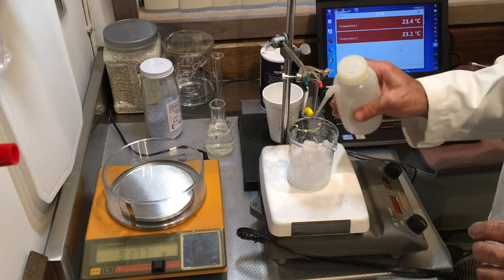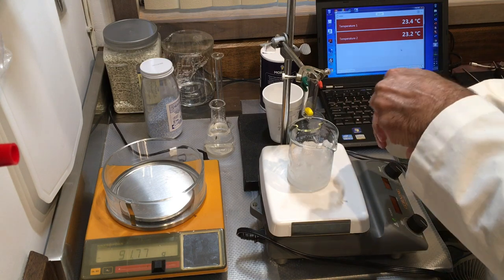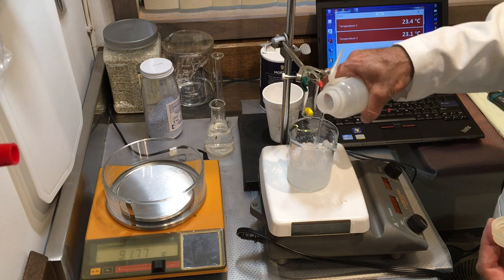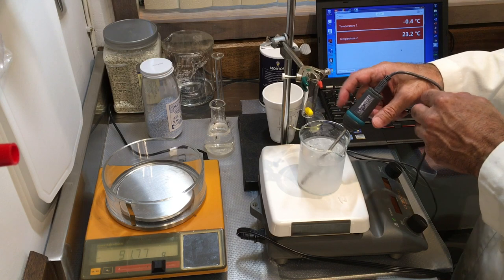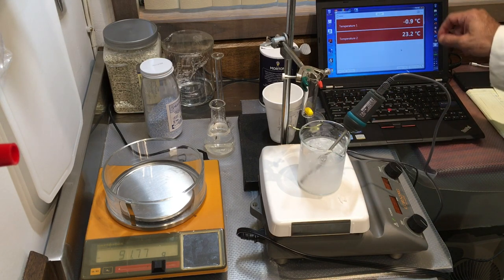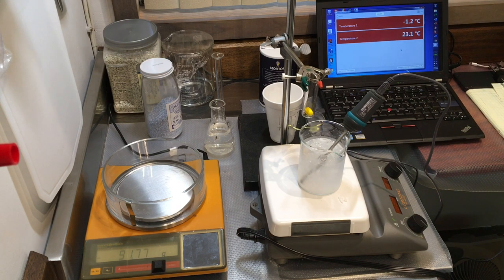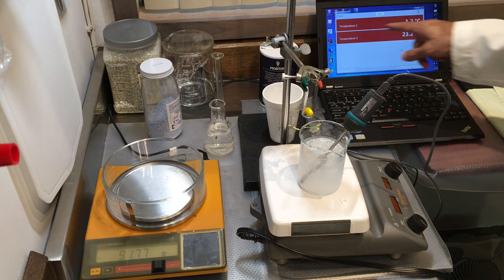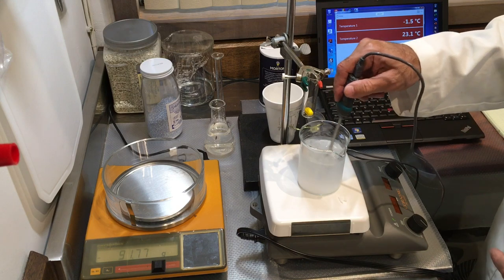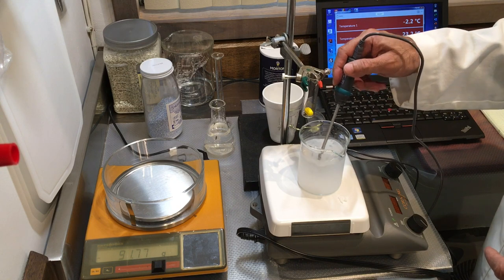I'm going to add some more water to make this more of a mixture. You can see the temperature of the bath — this is our first temperature probe — is dropping. It's gone down to negative 1.1 degrees Celsius. I'm going to add a little bit more ice to bring it lower.